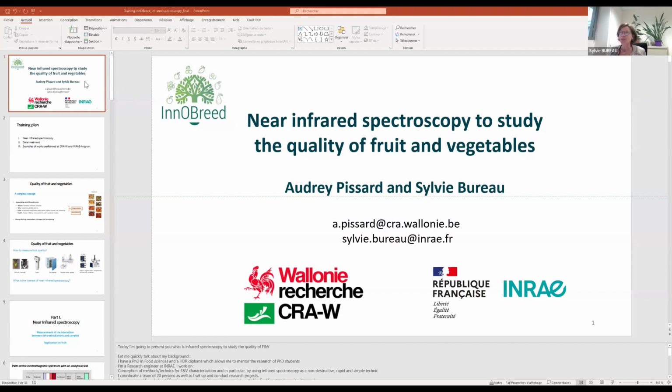So now we are going to talk about near-infrared spectroscopy in order to study the quality of fruit and vegetable. So we are two speakers, Audrey Pissard from research in agronomy in Gembloux, in Wallonie, and me, Sylvie Bureau from INRAE at Avignon.